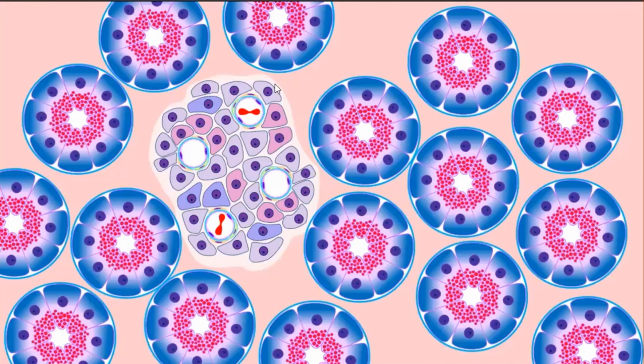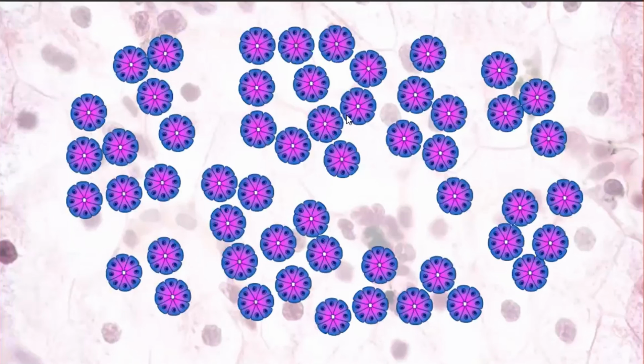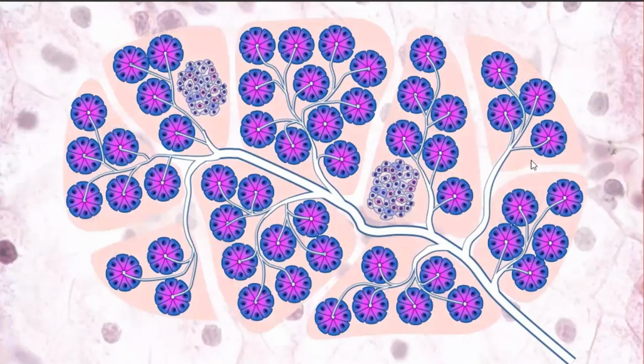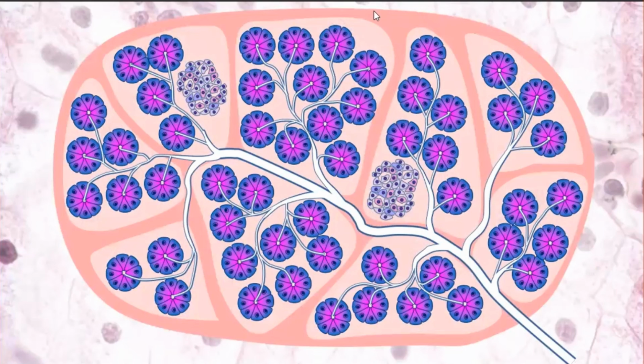So here we can see pancreas. Here we have islet of Langerhans, also exocrine secretory units, and they are surrounded with interlobular connective tissue stroma. And here we can see secretory units. They are neighboring structures to the islets of Langerhans. Secretory units are opened in the ducts. It's the duct system of pancreas. Also, there is stroma of lobules which surrounds the lobules, and between the lobules we have septa, and entire gland is covered with connective tissue capsule. So it's general structure of pancreas.